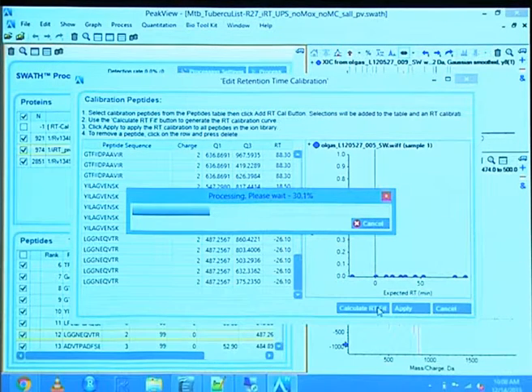Whenever you do this, I would recommend that when you have all of them, you go through them and have a look and make sure that these peptides actually give you a good result. And I need that because I want to show you how you can correct or edit it, as well as control it. Are there questions?